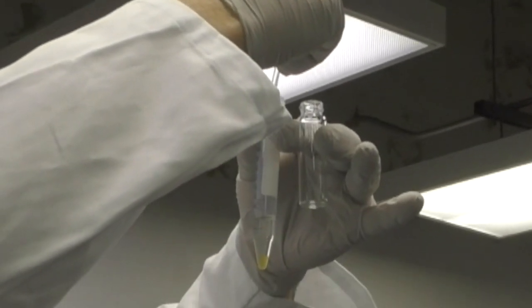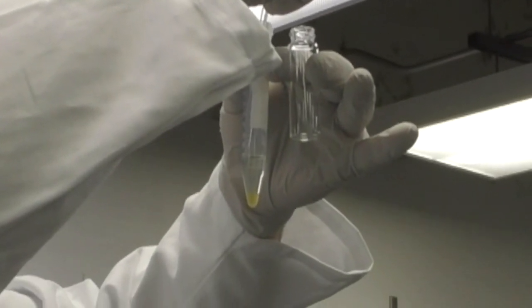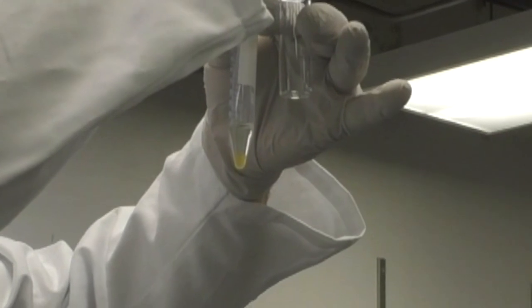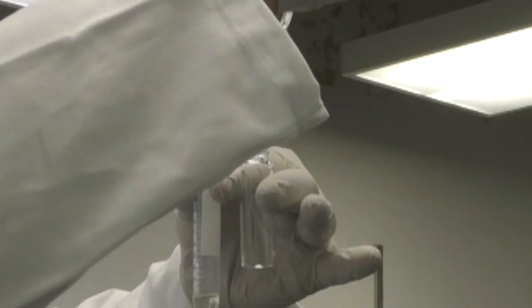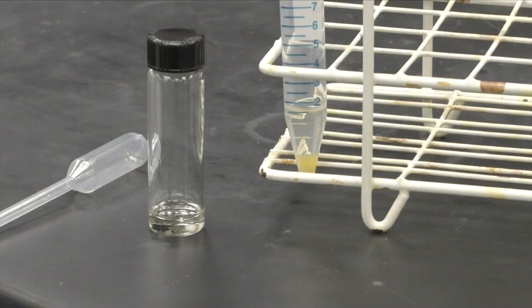Using a plastic transfer pipette, remove about a half a milliliter up to maybe 1 milliliter of the top layer into a 4-dram vial. This is the fatty acid methyl ester you will use for analysis.